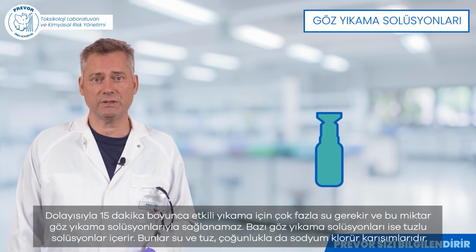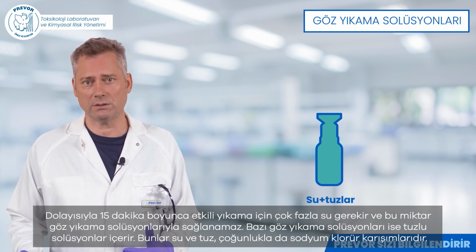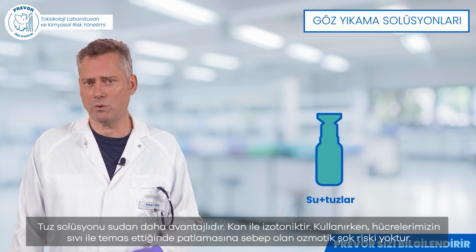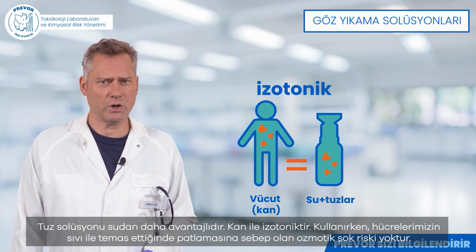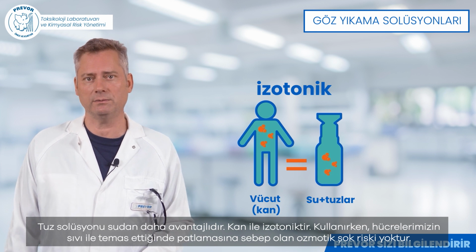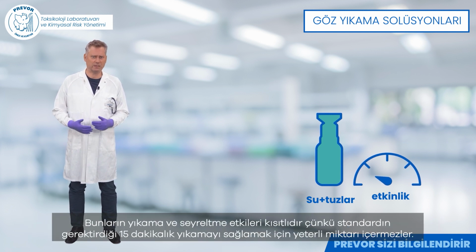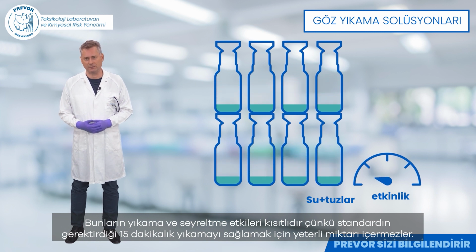Other eye wash solutions contain saline solution. These solutions are a mixture of water and salts, mostly sodium chloride. A saline solution has an advantage over water. It is isotonic to blood. When using it, there is no risk of osmotic shock that could cause our cells to burst upon contact with the liquid. On the other hand, these eye washes have the same drawbacks as the bottles containing sterilized water. Their rinsing and diluting effects are limited because the quantity of liquid is too small to ensure the 15 minutes of washing required by the standard.